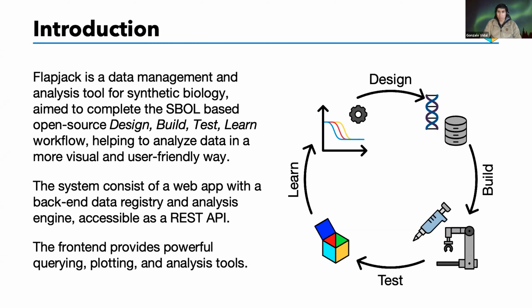It aims to complete the SBOL-based open source DBTL lifecycle. Flapjack centers on connecting the test and learn stages, collecting and storing experimental data to make it accessible and machine readable. The software consists of a relational database and an analysis engine as backend, accessible through a user-friendly web app frontend or through a REST API. The frontend provides powerful querying and plotting and analysis tools.